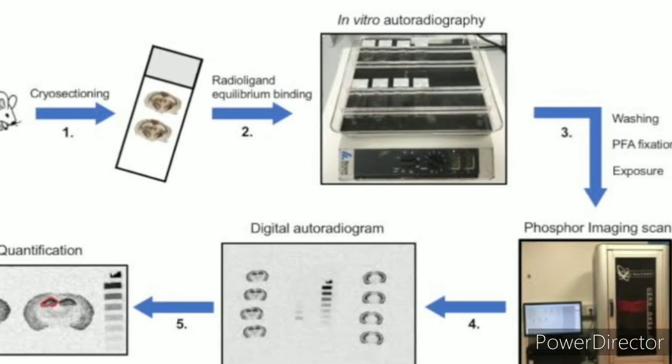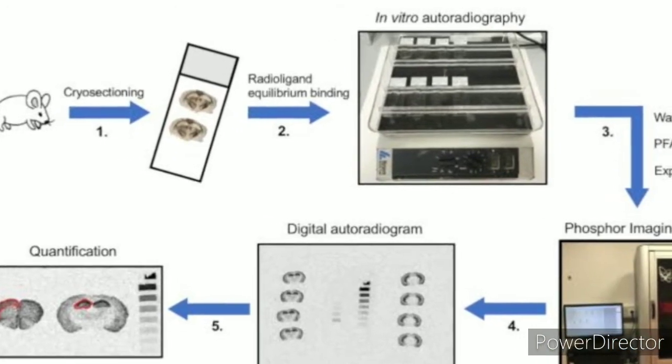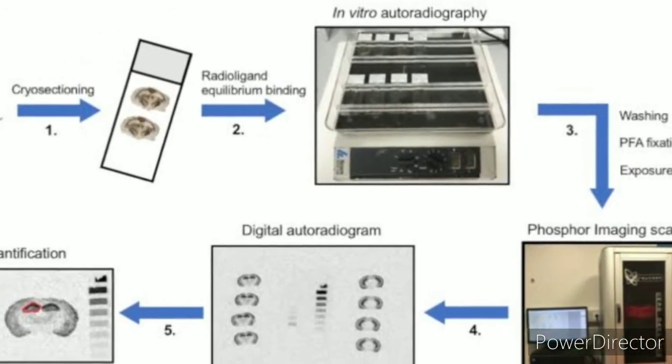What is autoradiography? It is a technique that captures the image formed in a photographic emulsion due to emission of light or radioactivity from a labeled component placed together with the unexposed film.